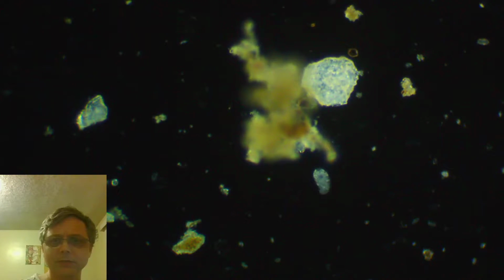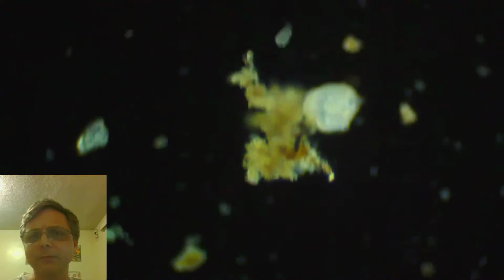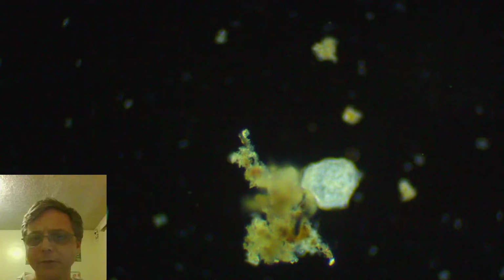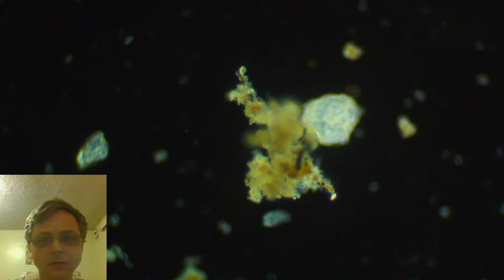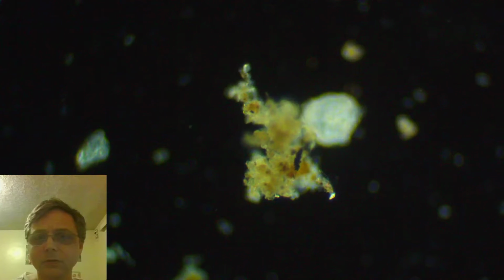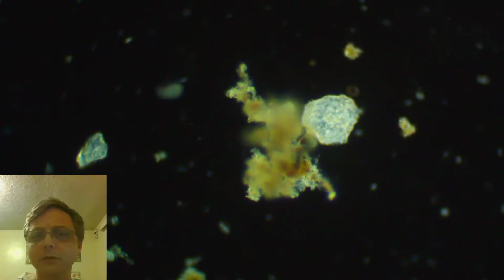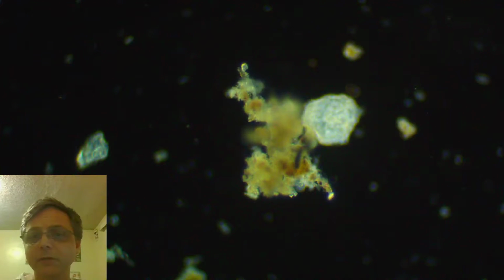There are two basic shapes of paramecium. This would be the second type if it is that, the less common one, I guess. He's hard to look at. He keeps moving. But basically it's like a kind of potato shaped thing.